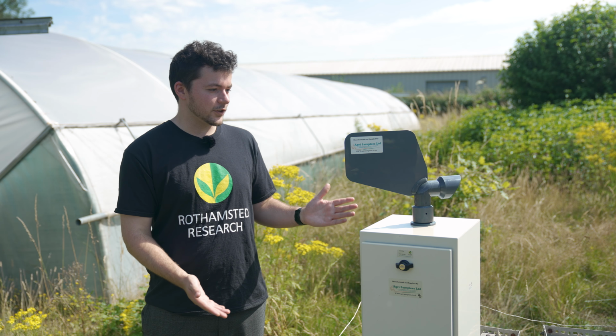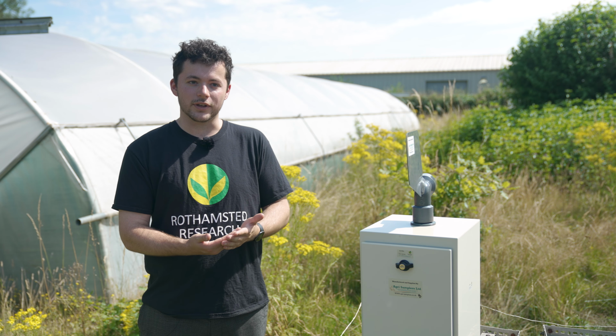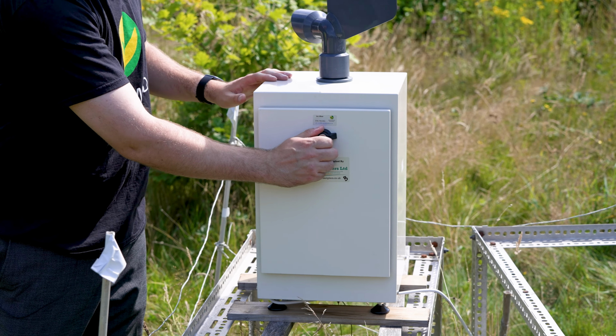And this is actually our most powerful spore sampler that we have today that sucks in over 200 litres of air a minute. And what you'll notice straight away is the weather vane at the top here, and that ensures that the air intake is facing the direction of the wind. So now I'm going to open it up and we can have a look inside.